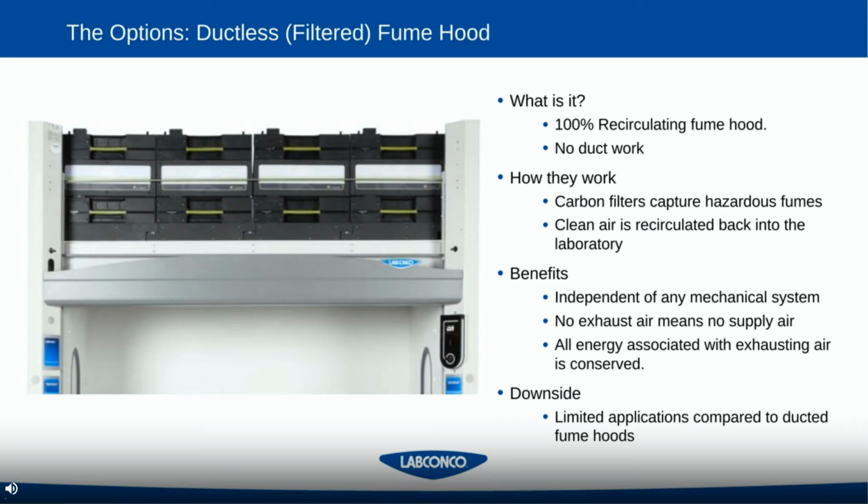It's a big deal, and it's a great option, especially for energy-starved labs that don't have the capacity to have a ducted fume hood. The main downside with the ductless fume hood is that there are limited applications when you compare them to a ducted fume hood. However, manufacturers of these types of fume hoods across the entire industry will supply some sort of application review. So you'll get verification essentially from the manufacturer of the hood or filters that your application is compatible with them, but the amount of applications is reduced as compared to ducted hoods.